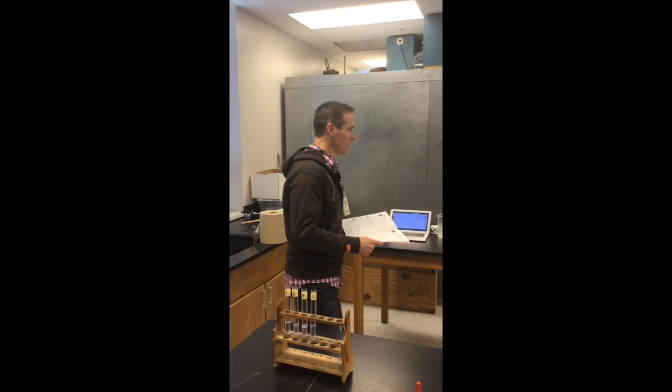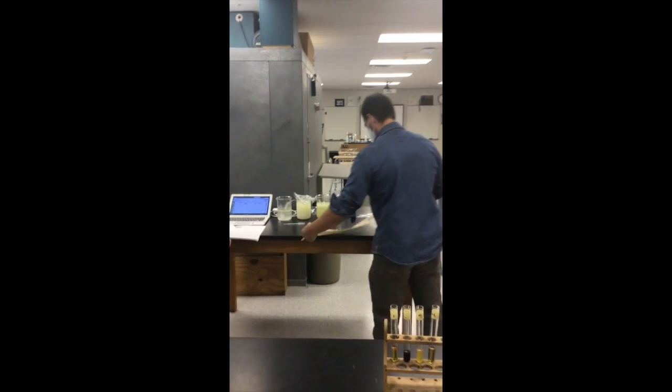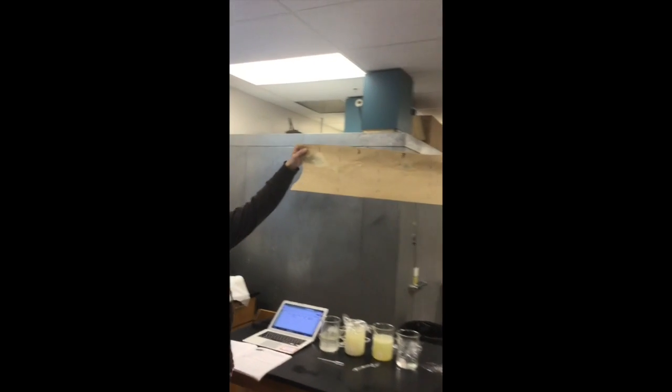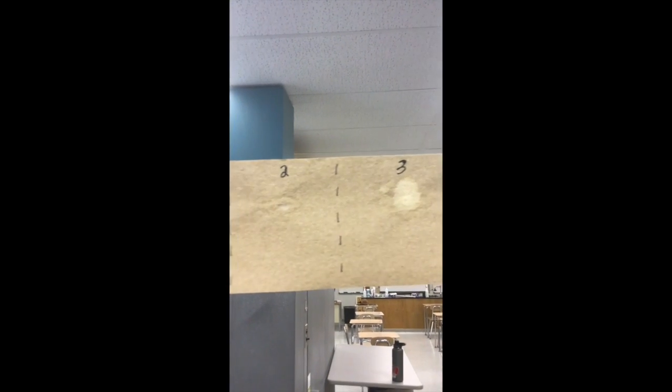Mr. Ardente, are those papers dry yet, or are they still kind of wet? Yep. All right, we'll hold them up to the light. Mr. Kedzie, if you want to come back over here, and we are looking to see if they are transparent. And it appears that there are definitely some positive and negative test results. So we'll go ahead and show you the data. And again, the ones that are transparent have lipids in them. So are there any unknowns that appear to have lipids in them?